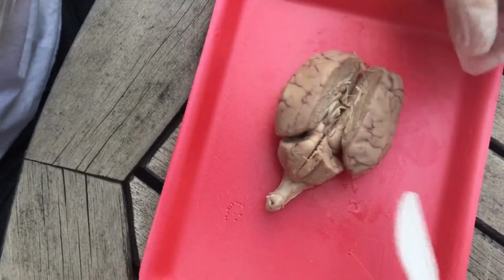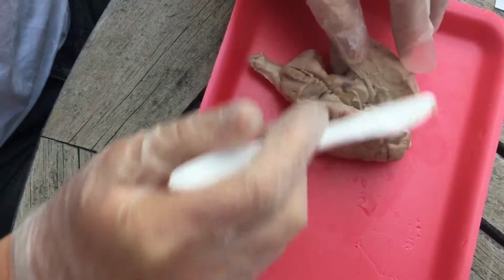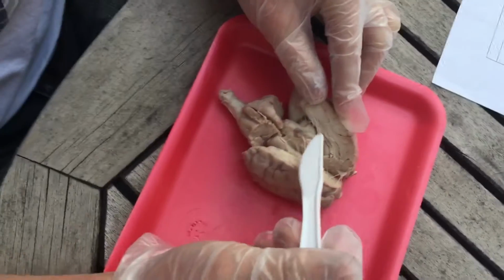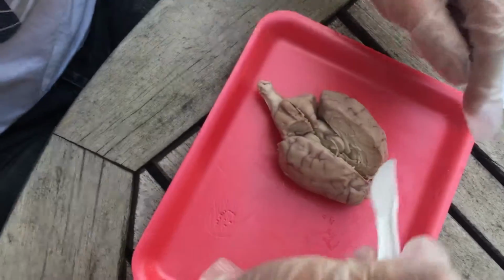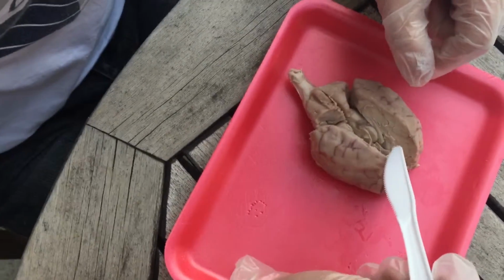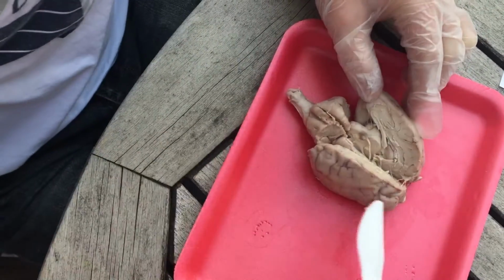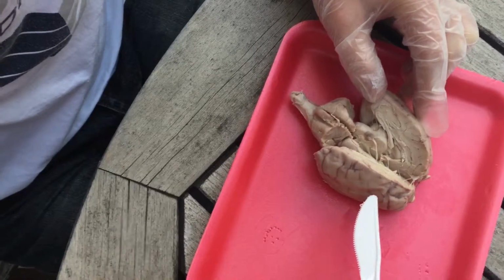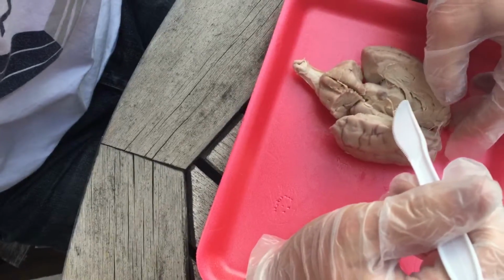Now we're on to the corpus callosum. And the corpus callosum is going to be located right here. The corpus callosum is the communication between the two different hemispheres, which we talked about earlier. And then the pineal body is right here. And it's also known as the pineal gland. And this is where the melatonin is, which helps us fall asleep at night.